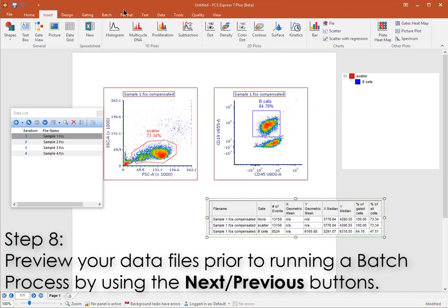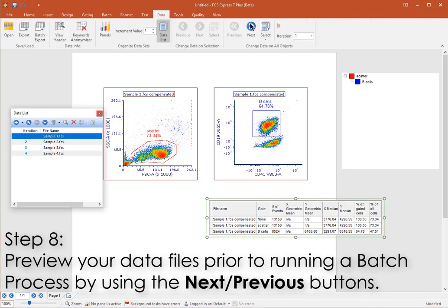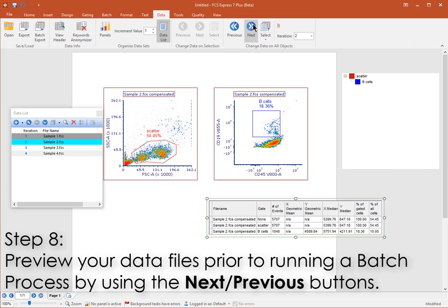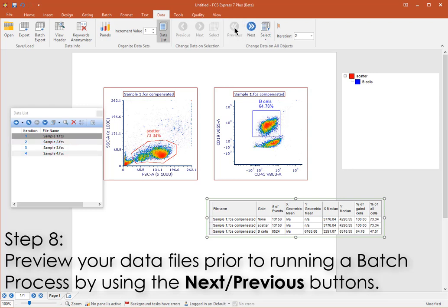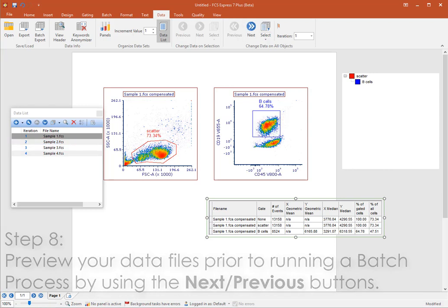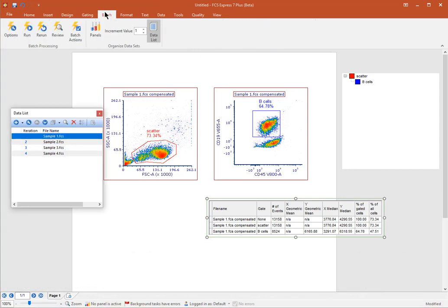Before you run the batch process, it's a good idea to preview the entire list of data files without creating replicate sets of plots for each. Simply use the Next Previous buttons on the Data tab to iterate your samples through your complement of plots.